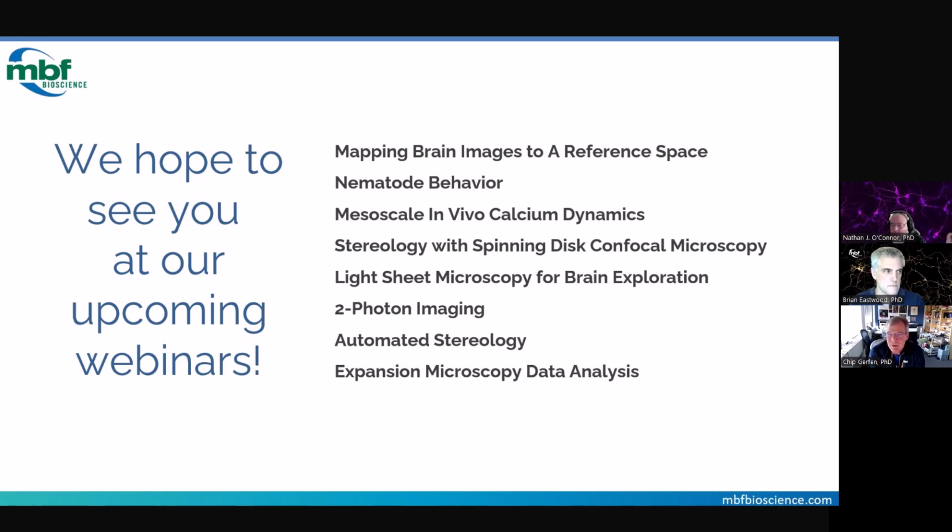We cut every section. The example that I showed was every section, cut at 50 microns. A typical mouse brain, from the front of the brain through the cerebellum, is about 120 to 140 sections at 50 microns. It would be possible to do every other section, but we do every section because it makes for much better registration and just better analysis all around.